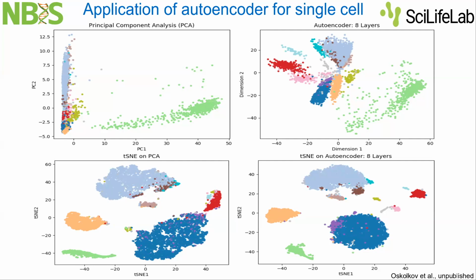They have limited applications for visualization and dimensionality reduction purposes, although they are good at data pre-processing. If you want to pre-process your data using some non-linear activation functions, and if you want to pre-process your data for some other machine learning purposes, then probably autoencoders are promising.